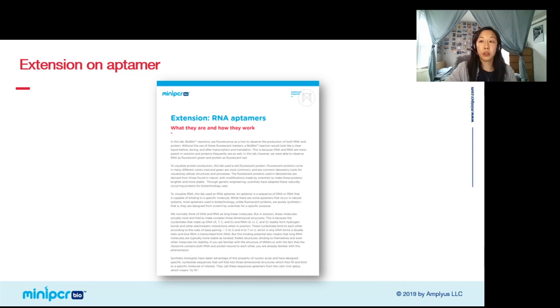And for teachers who are teaching more advanced students who want to do a little more extension, there's an extension included here that covers the RNA aptamer. It delves into how researchers and scientists discovered RNA aptamers and how they use them in their research. They use them to light up structures in cells as well. So this is a great extension to learn more about how it works, and students can actually do sequence analysis of the RNA aptamer to see where it would bind up on itself.